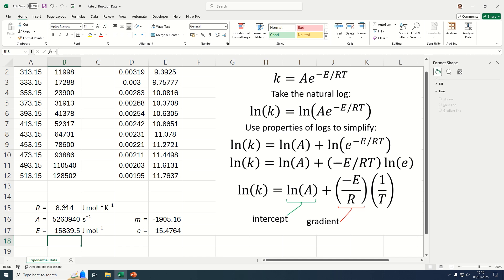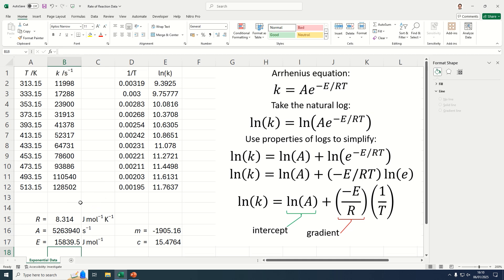So that's been a video showing us how we can linearize rate of reaction data and then actually work out the activation energy and the pre-exponential factor for that data based on the Arrhenius equation.